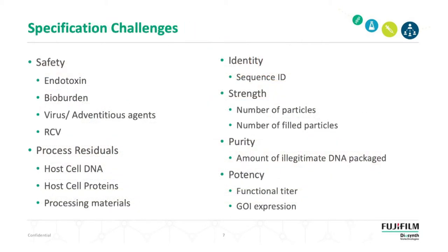So I'm not going to go through a detail of all the specification challenges that are associated with these products, except to say that really they fall into two kind of categories, which I've tried to put on the two columns here. So there's a whole host of fairly standard safety and residual testing issues or specification items that really are the same as for protein biologics. It's got to be free of bioburden, we've got to get rid of endotoxin if there's any in there, we've got to make certain it doesn't have any virus that it's not supposed to have.